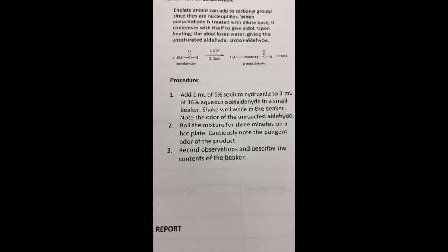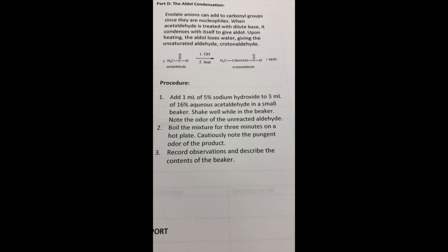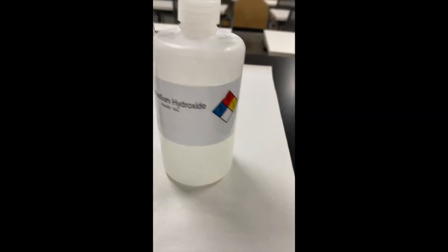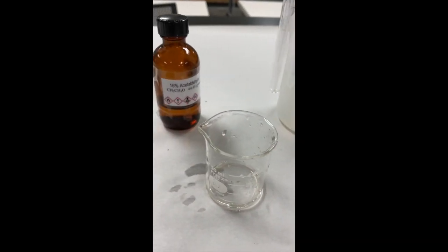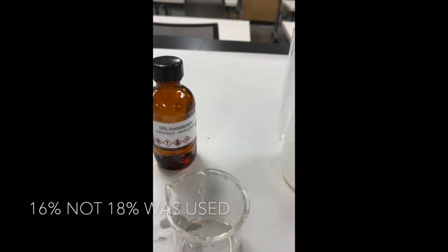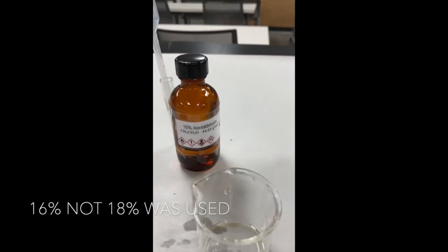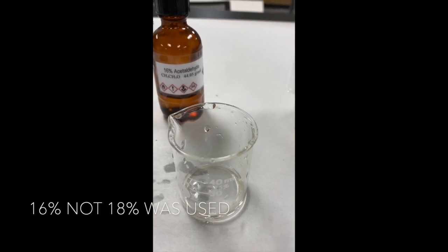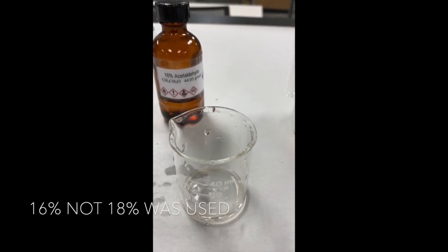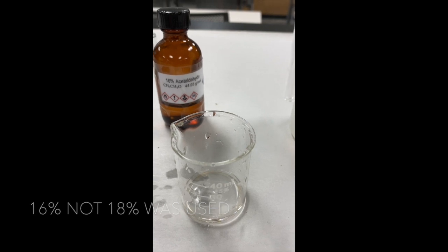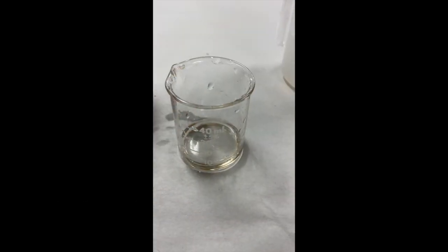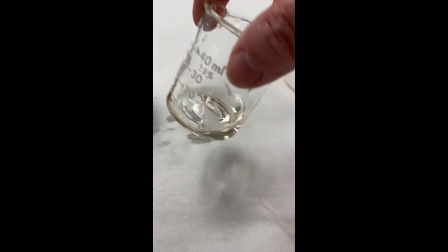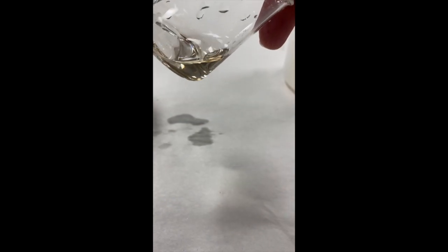It's time for the aldol condensation. I've already added one mil of 5% sodium hydroxide to my beaker. I'm going to be adding the three mils of the 18% to the beaker and then I'm going to shake it. I'm going to notice the odor and then boil it for three minutes and then we'll be back. So after adding both components, there's no precipitate. Let's go ahead and heat it up.